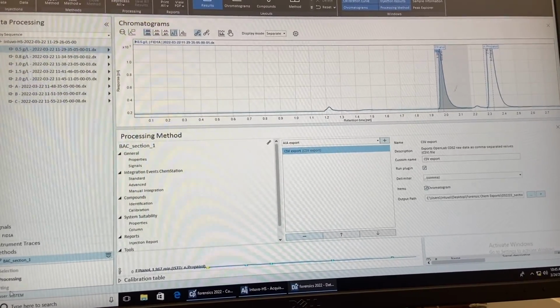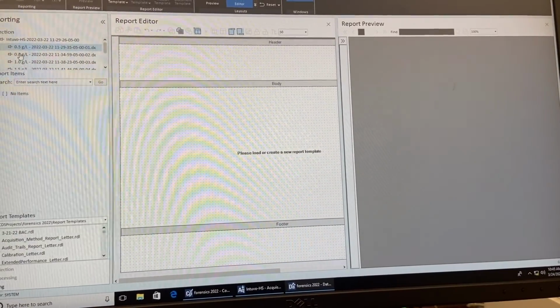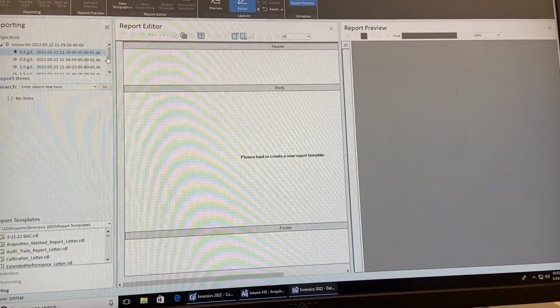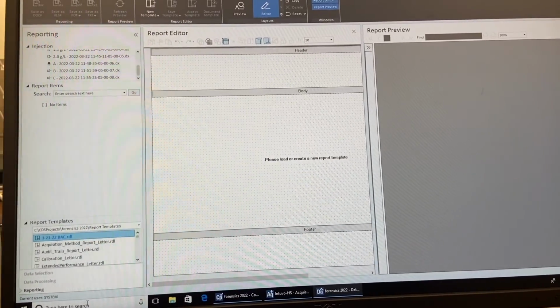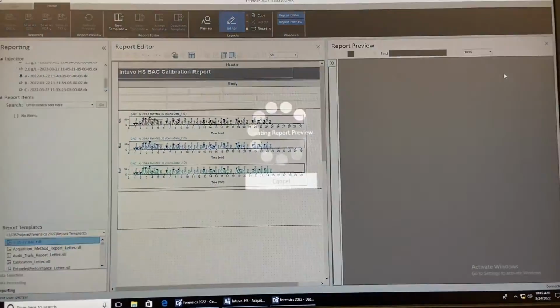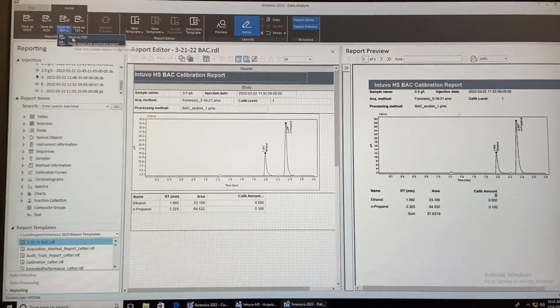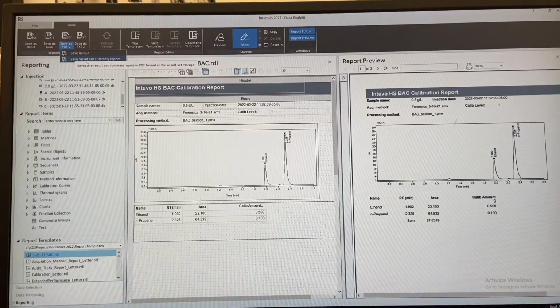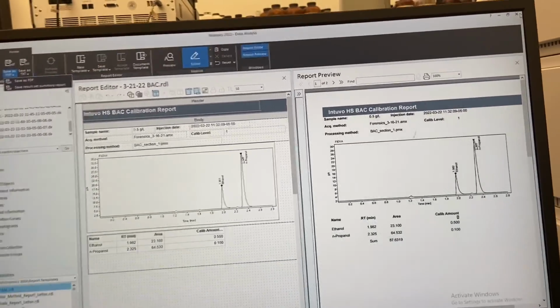And actually you can go ahead and make a report only using your samples. So you would click on your sample, say you did an unknown A, and then you would go ahead and click BAC, and you would get this file over here, and you would save that. Save results set summary report as PDF, and that's what you do. Again, you don't have to save this to USB. I will be doing that, and that's all.